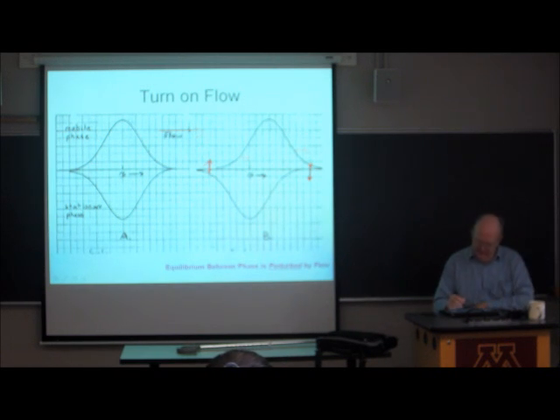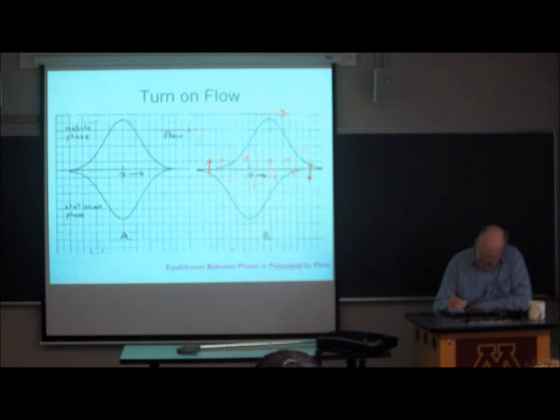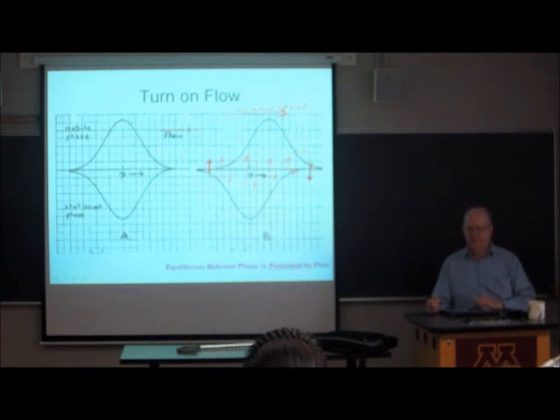So you want these processes to be very fast compared to movement along the column. We can call this longitudinal or axial, and we can call the perpendicular to that the transverse or radial.